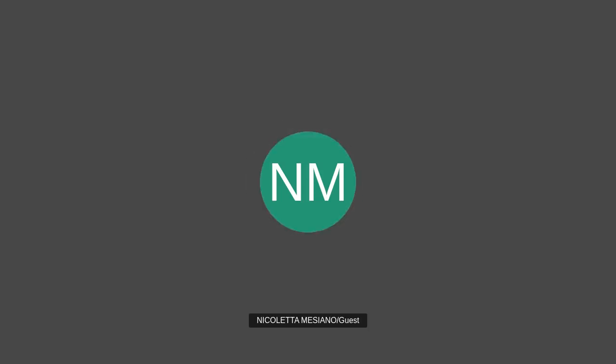I have a question for Nicoletta. He explained that the cuvette for ammonia should not be kept 10 days outside; it should be kept inside the fridge, the refrigerator. Now we got all this equipment and all the chemicals and reagents maybe after 3 months. It was shipping somewhere, staying somewhere. So will it create any problem in the experiment?